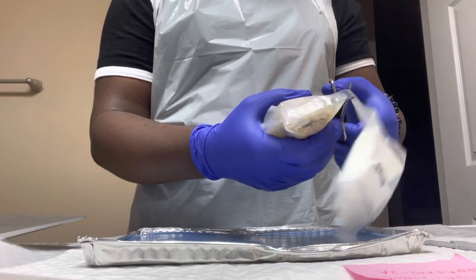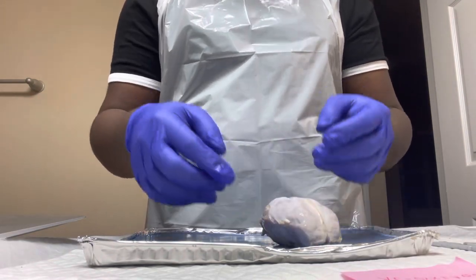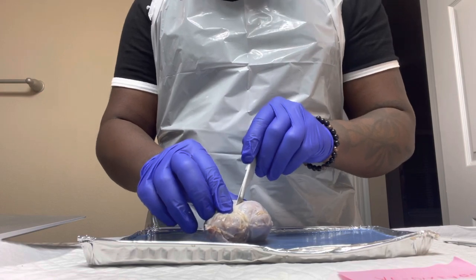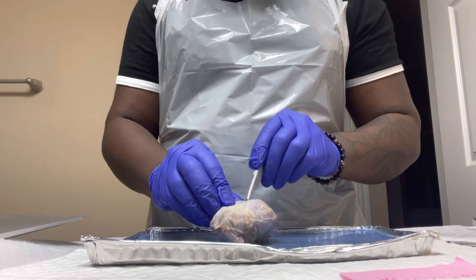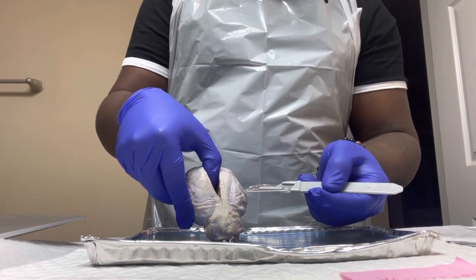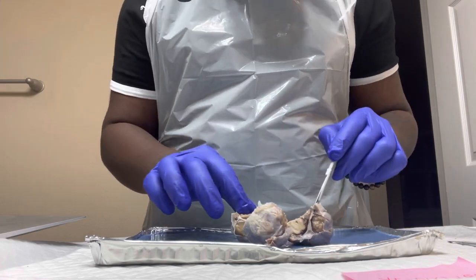Yeah. Literally, all I'm finna do is split this thing in three and take a picture. This is a sheep brain, very much smaller than, you know, a human. Oh, it stinks. Make a good incision right down there, right down his medulla oblongata. That's what I'ma do. And then I'm gonna make a little incision right here and here. Where's the hypothalamus, the thalamus, the hippocampus? Where's all that stuff at? I don't see none of that.